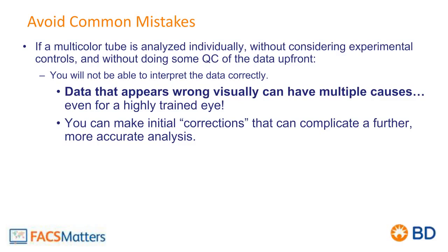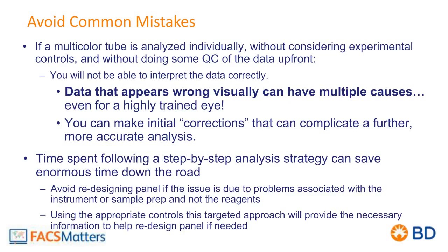In other words, data that appears wrong visually can have multiple causes, even for a highly trained eye, and the corrections that you make may complicate further and more accurate analysis. So I can't state this strongly enough, that the time you spend in the early development of your assay using a step-by-step approach that we're going to talk about can save you enormous time down the road. Basically, as the commercial says, you can pay me now or you can pay me later. So what you want to do is to avoid redesigning the panel.